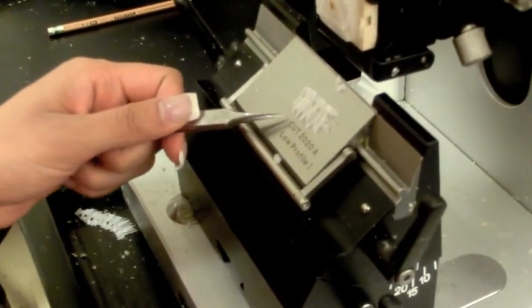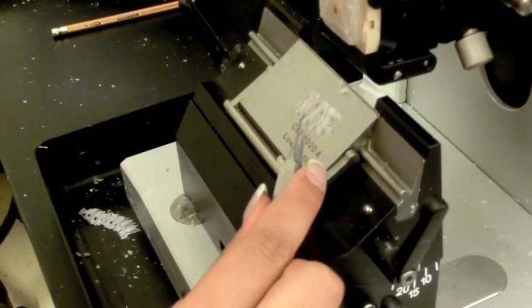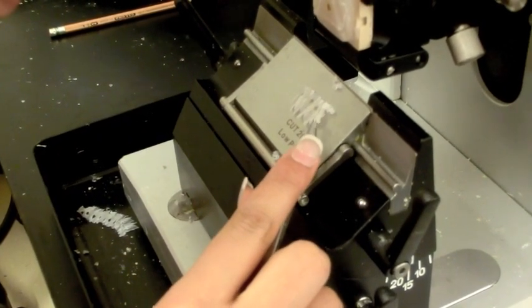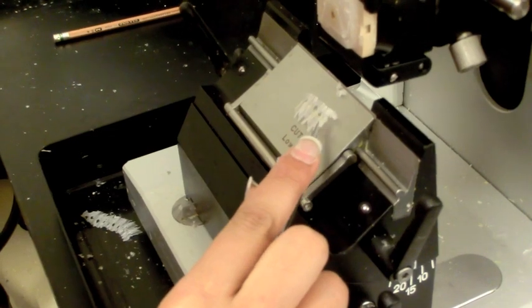Use tweezers to lift the ribbon from the microtome. Place it on the bubble of water on your labeled slide. Repeat making ribbons and making slides until a desired amount is reached.